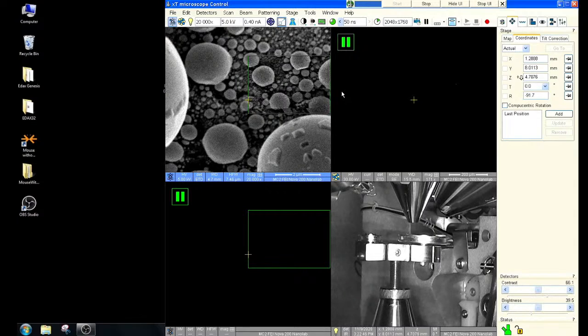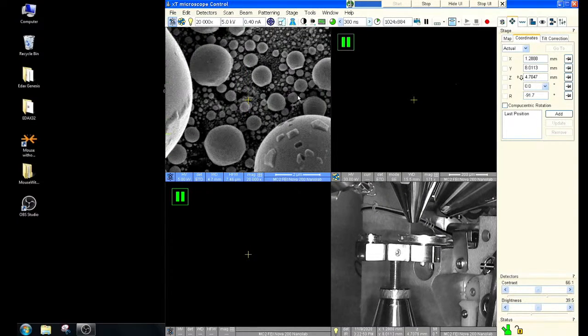And it's a fairly simple little experiment to try if you want. Just look at your count rates as you move the sample up and down in working distance, and you'll find that it forms some kind of a peak. And that peak value will be where your sample is right in line with the EDS detector.